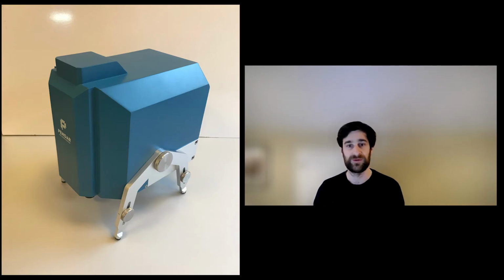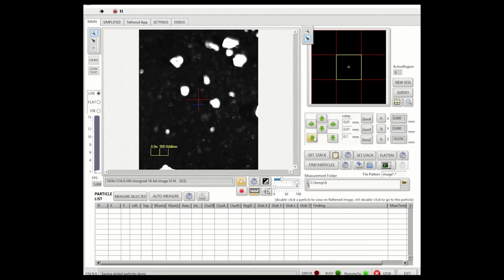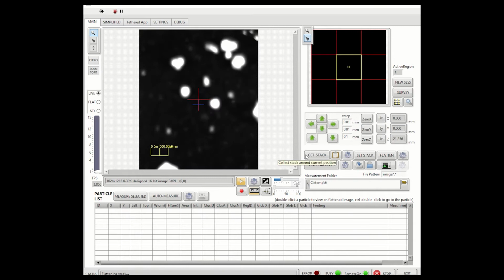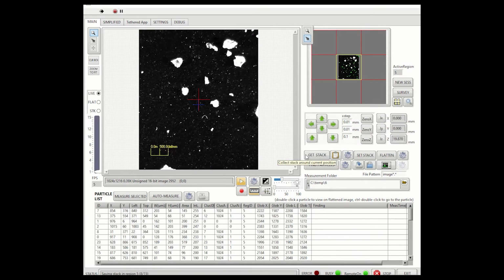Let me now describe what we did for this demonstration. We placed some ammonium nitrate powder on a table, spilled some, and then took a napkin and wiped it a couple times completely off, so that to your naked eye, you couldn't tell that there was a powder left on the surface. Then we placed the instrument above that surface. What you see here is the interface for the instrument, and we're first manually adjusting the focus, and you see the live image going in and out of focus. Then we take a survey, and we start taking a stack of images that we're going to use to obtain an image that is sharp across the entire field.